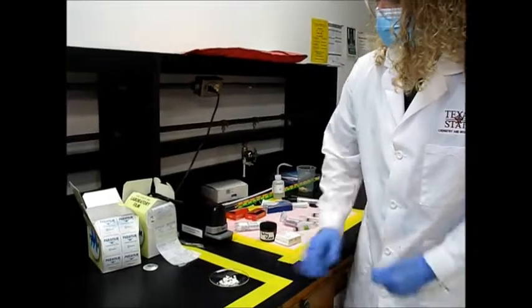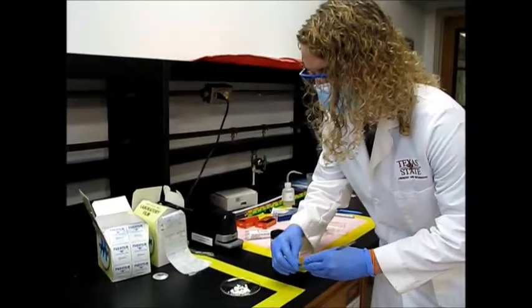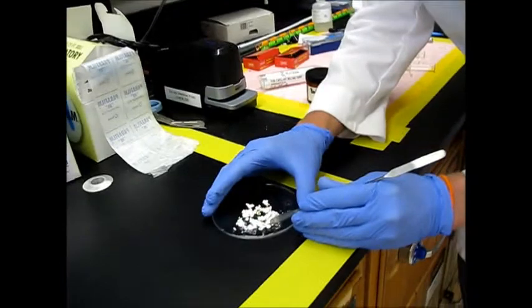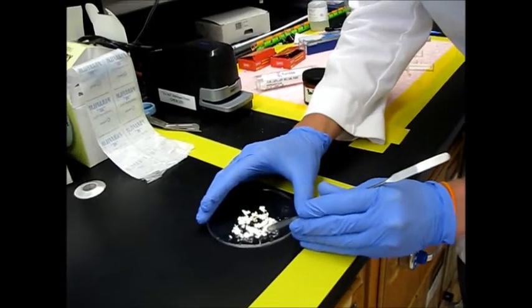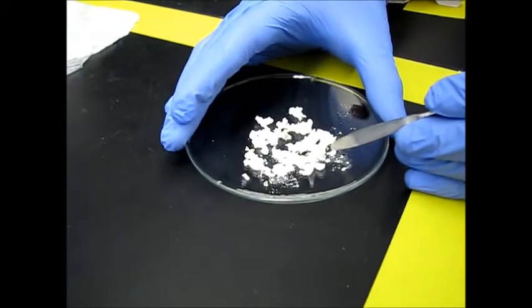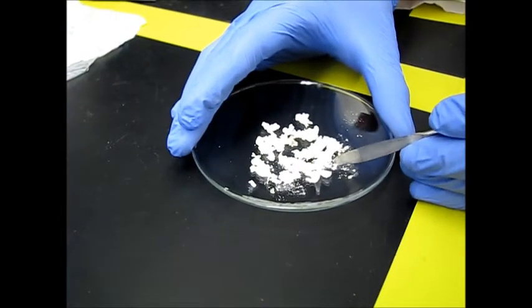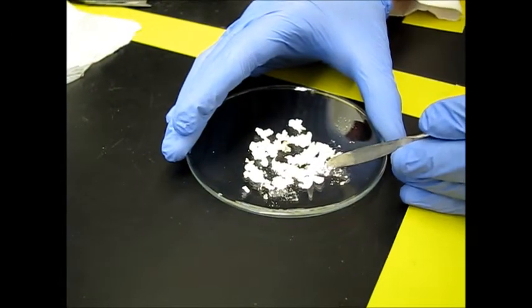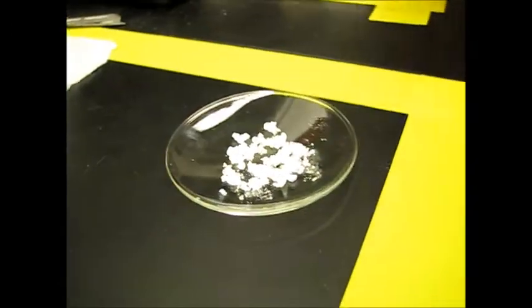So the last part of our analysis is a melting point analysis. We did this in OChem 1, but we're just going to go over it for this experiment here. So we're going to break up our product into nice small chunks. Cool, so that's probably good.